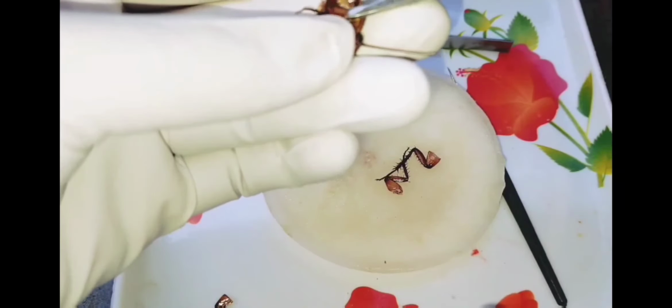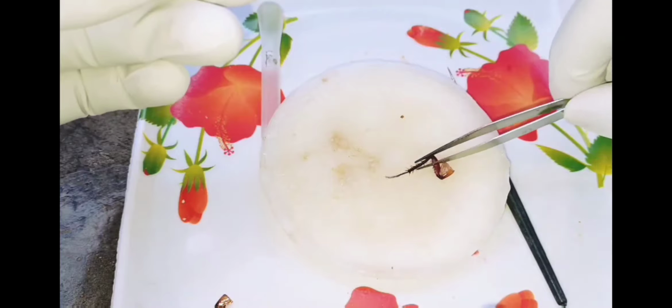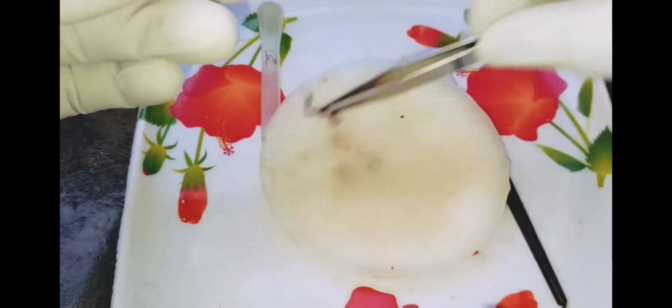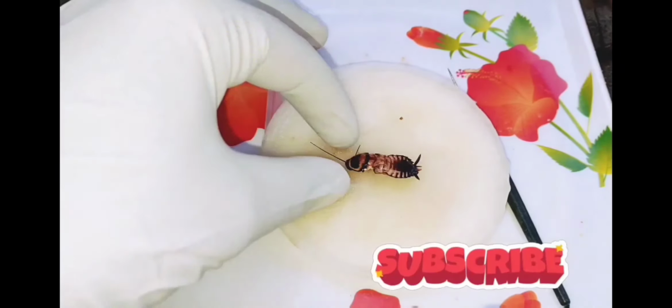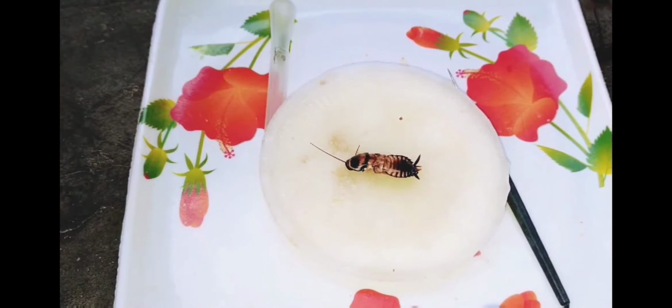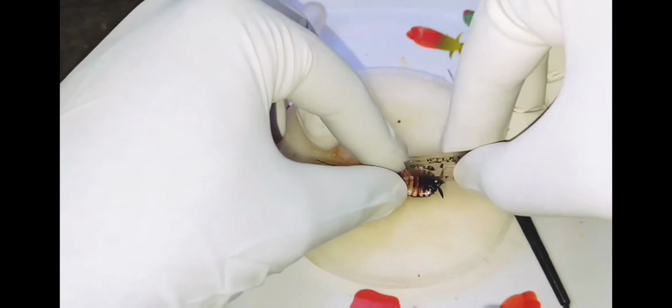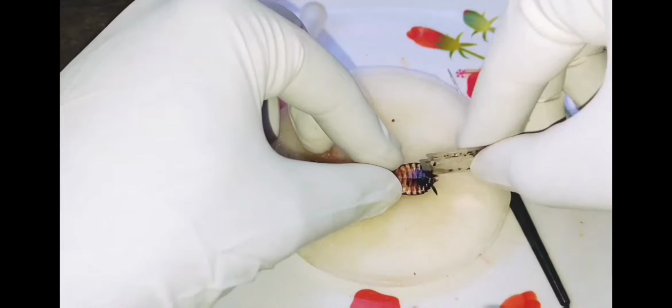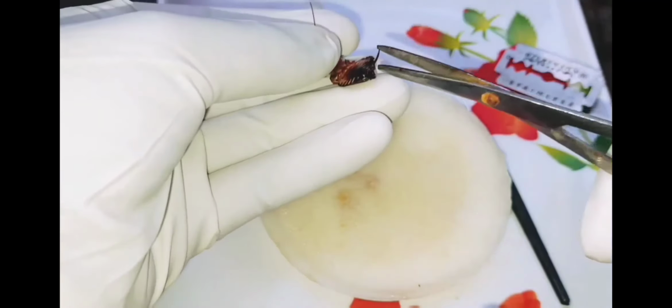Now you cut both ways. Now make a cut. Slowly you should make a cut. Then take a scissor and cut from here.